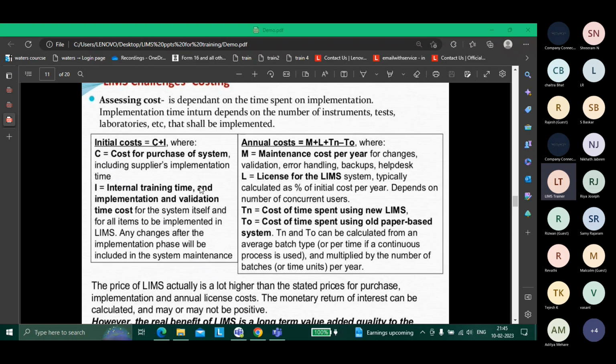Analysis mapping, like, already an analysis is built. Now I am trying to create a new product. I need to write a query and see if that analysis is present or not, if something matches or not. If something matches, I won't create a new analysis. Maybe I'll create a variation of that analysis. If not, I'll create a new analysis. That is what I believe mapping is, as per my previous experience. If you are talking about that, sir, it's not possible to cover here, because that's a big topic. I need to teach you when and how you need to do mapping. Why, when will it not match? When will you create a new one?